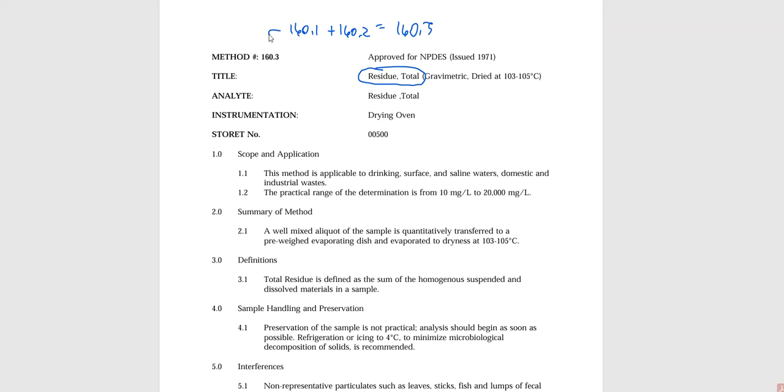I don't need you to do a filtration step where you're telling me, oh, this is how much solid went through a filter paper, and this is how much solid stayed on top. I don't need any of that information. Thank you, but no thank you. I just want an idea of the overall dirtiness of what this sample might bring to the table. And hence, this is the total residue aspect of what we're doing here.